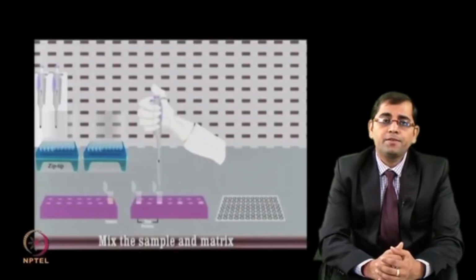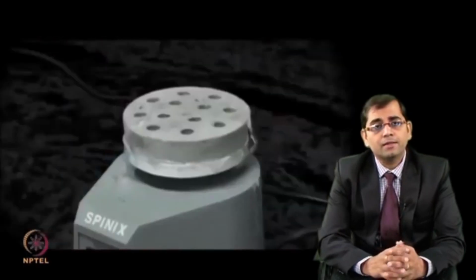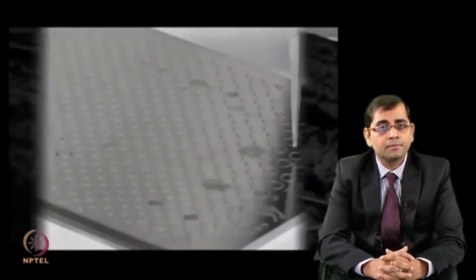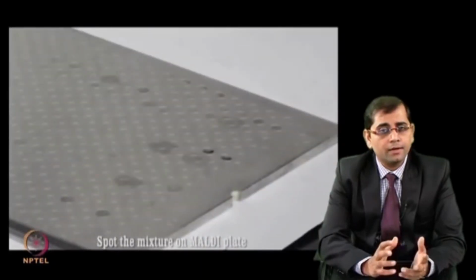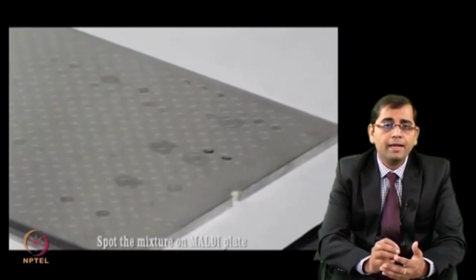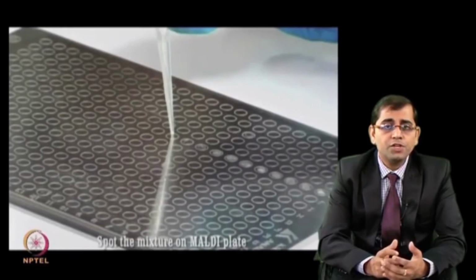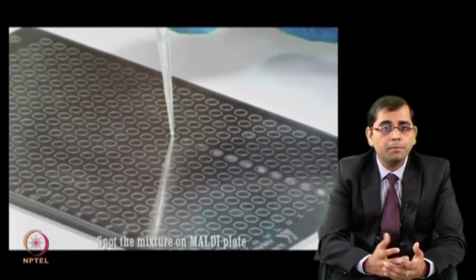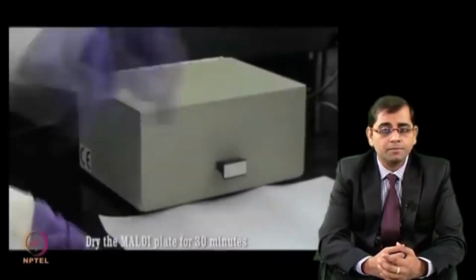The sample preparation strategy prior to mass spec analysis will be discussed in lecture 10. Once the protein sample has been digested, all the salt, buffers, and any detergent must be removed from the sample, which can be effectively performed by using filters such as ZipTips.